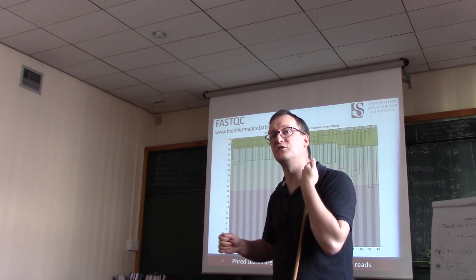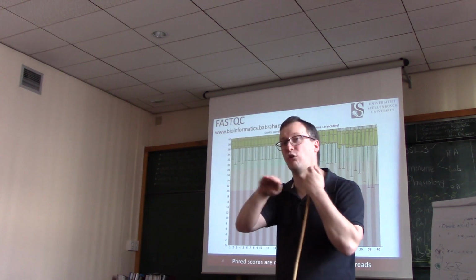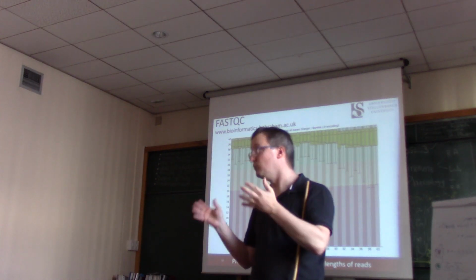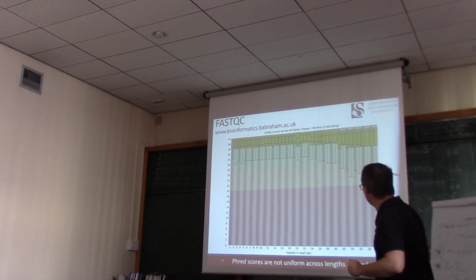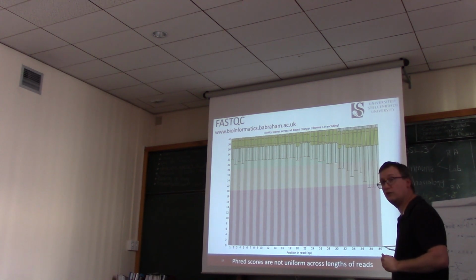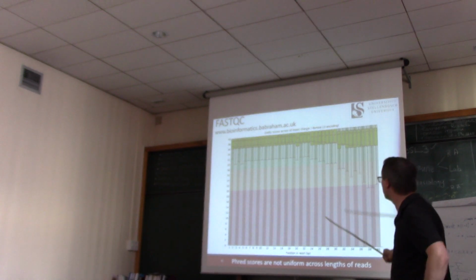So one of the things we can do is ask, what is the typical quality score as we range across this read, or across this collection of millions of reads when we're doing it this way? So here we're comparing across many, many different base calls. Here we have a sequencer that's outputting 40 letters in each read. So these are really short reads, like the old school Illumina stuff.